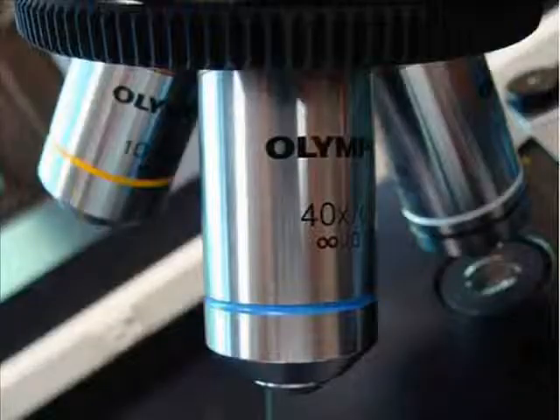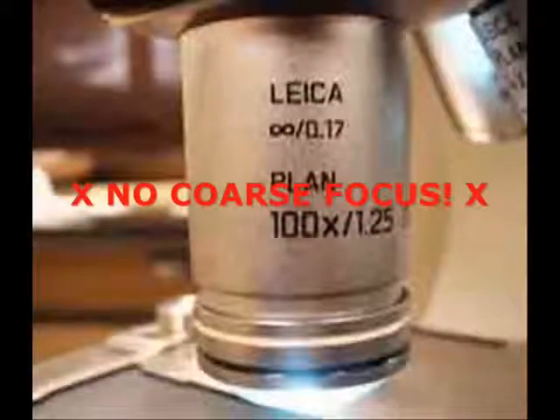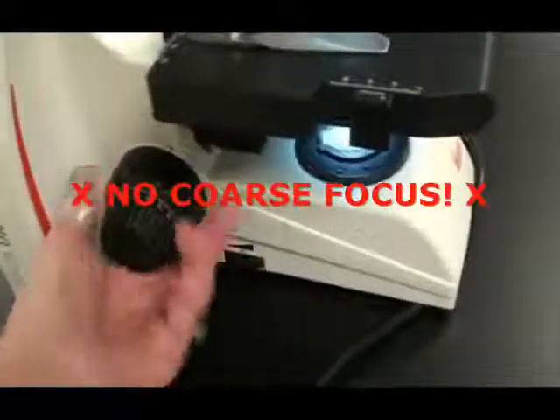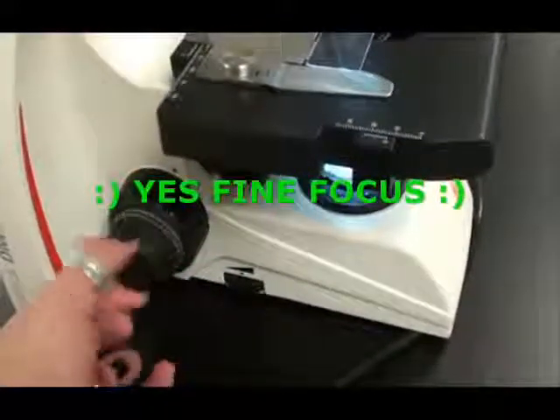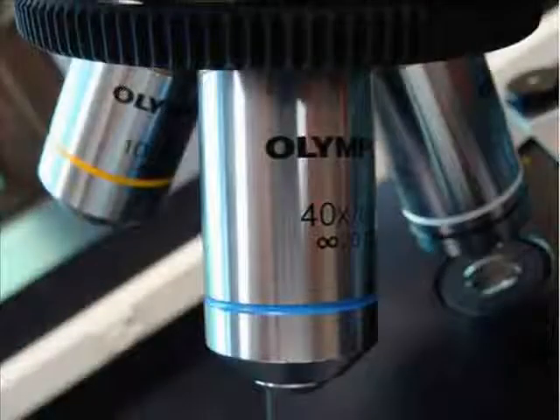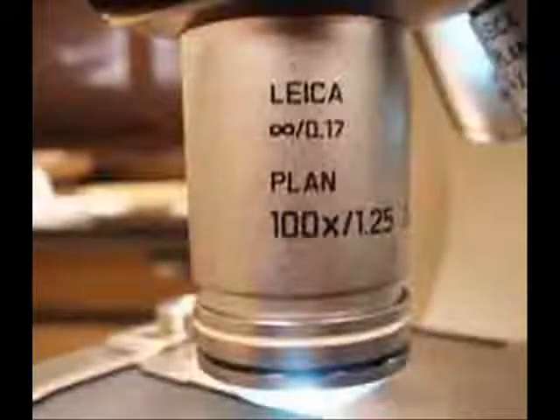An important warning: whenever you are using your high-dry objective or your oil immersion objective — these are your two longest lenses — never adjust the coarse focus. When using these longer lenses, you are only allowed to use the fine focus, that knob set within the coarse focus knob. Manipulating the coarse focus when using these longer objective lenses will, at the very least, take your specimen out of focus immediately, and worst-case scenario, could smash the lens into the slide, damaging the microscope.